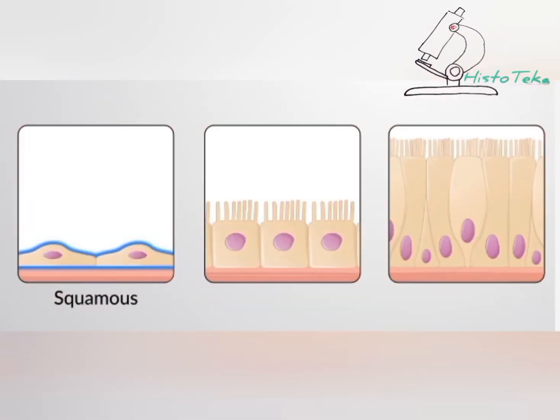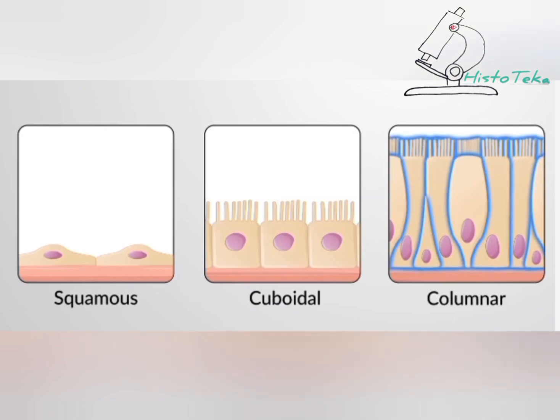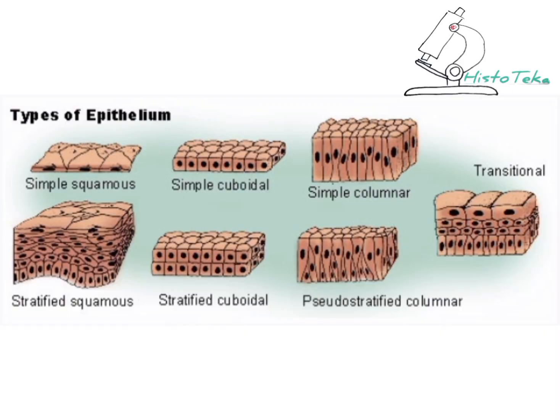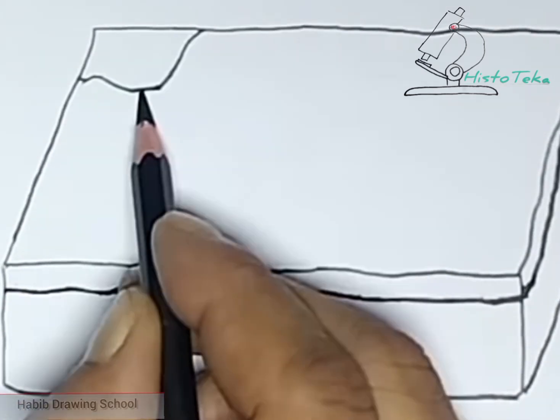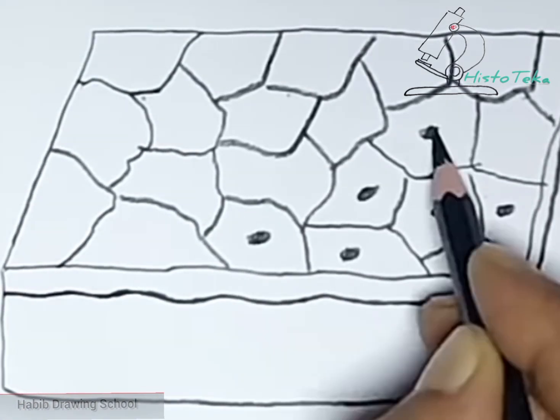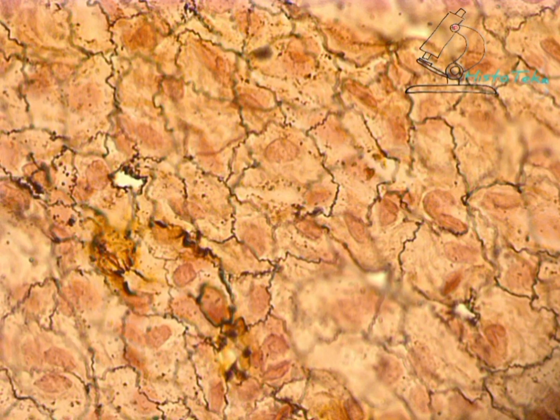Let me remind you that all surface epithelia, otherwise called the covering or integumentary epithelia, necessarily lie on a layer of loose connective tissue. This is due to the nutrition of the epithelium, which is carried out only diffusely. The basement membrane on which the surface epithelium is located acts as an intermediary between the epithelium and the underlying tissue, and is also necessary for the attachment of the epithelium to the loose connective tissue.